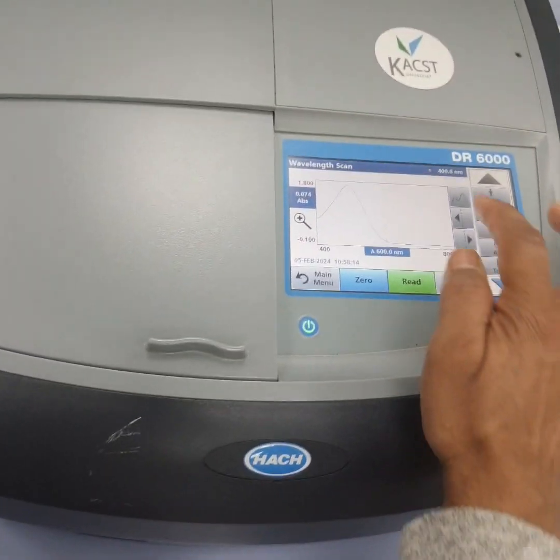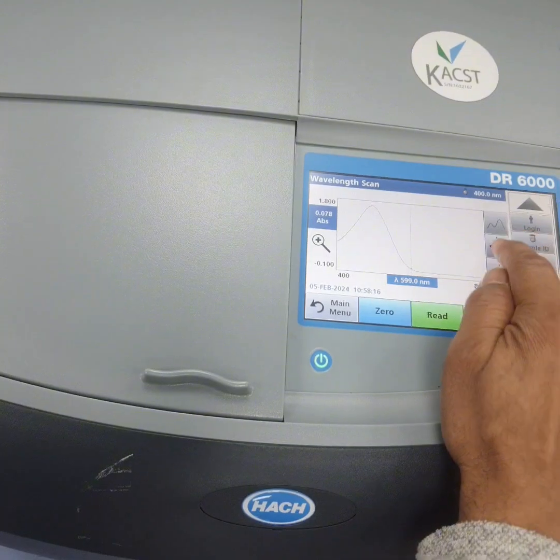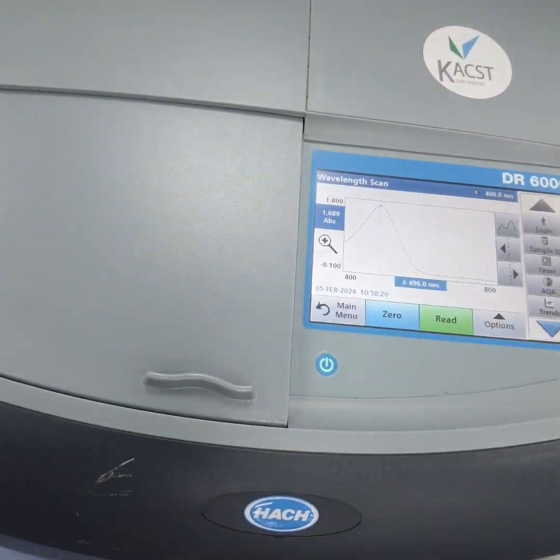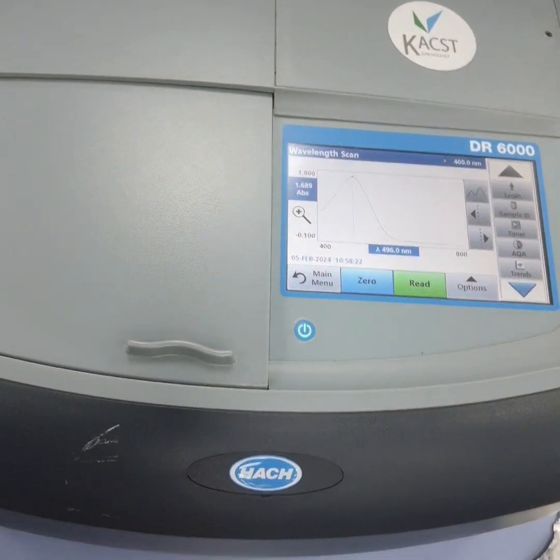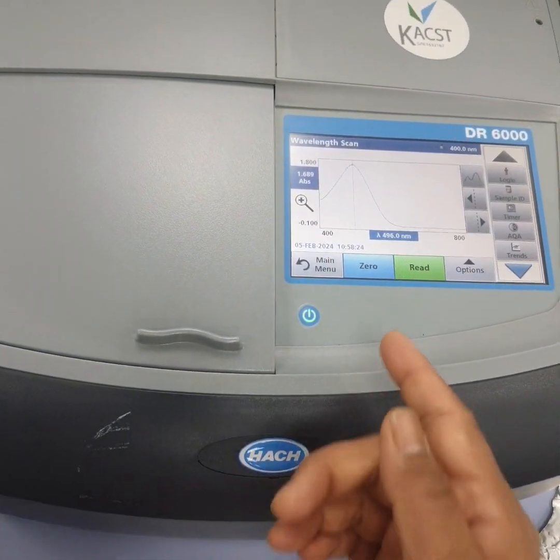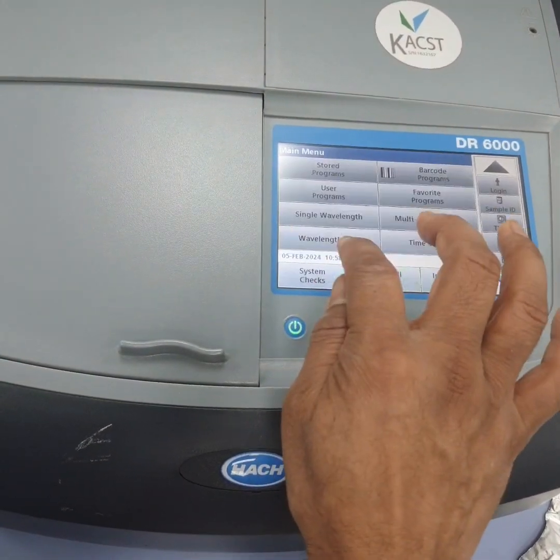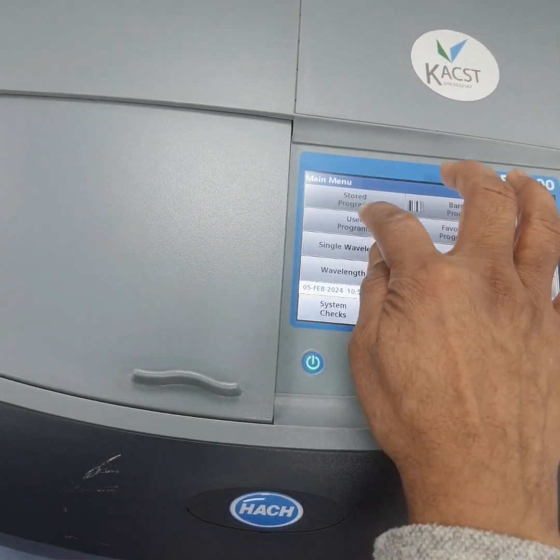Okay, now we will find out the maximum wavelength from here, the one we have to put in our calibration window. So what is the maximum wavelength? It is around 496. So this is my maximum wavelength for the Congo Red dye. Now I will come out of the window, and then I will go to my usual program.